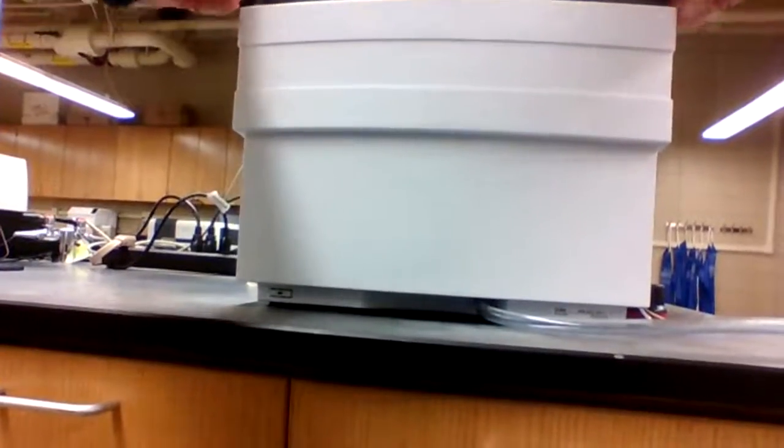Here are the samples that we would use. And what's cool about our instrument, I'll take it apart a little bit to show you, is we have an auto sampler. Really cool. Right there, if you look inside, this is an auto sampler tray.